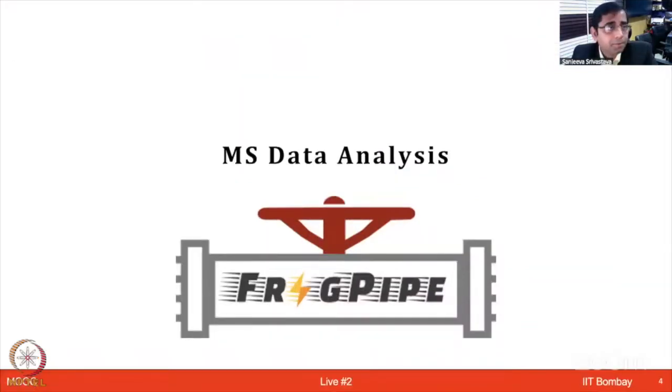This software comes from an academic lab, and it is so fast that you don't need too much RAM from the clusters. You can directly use the limited RAM and computing power of your laptop and analyze any kind of DDA and DIA workflow. So Amit, please share your screen and briefly show the FragPipe data analysis. Okay, thank you, sir.